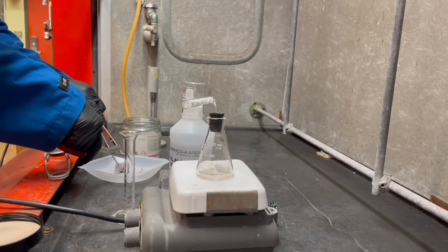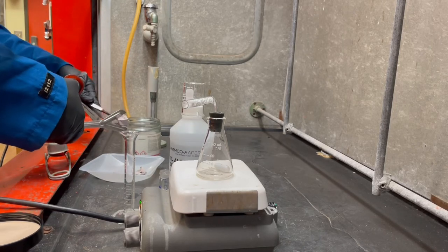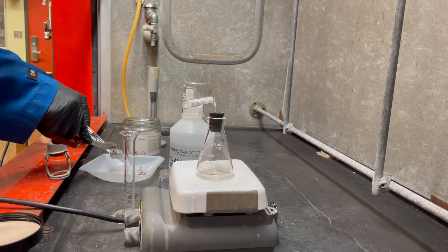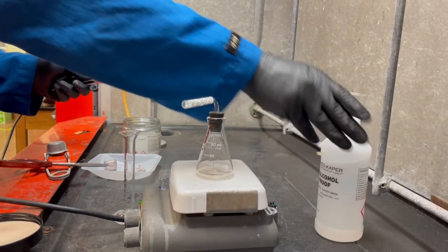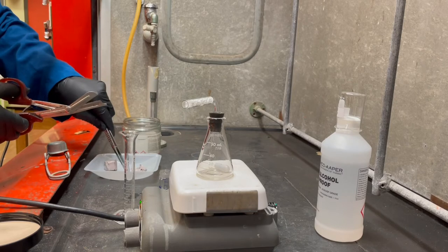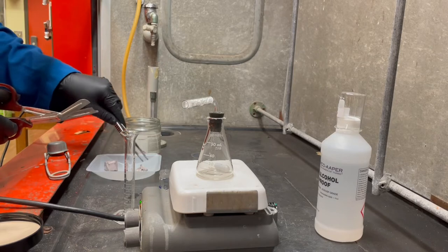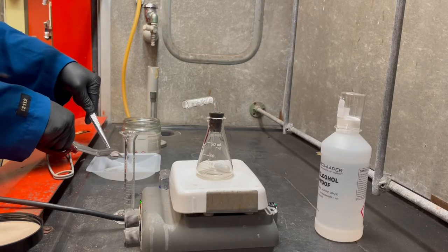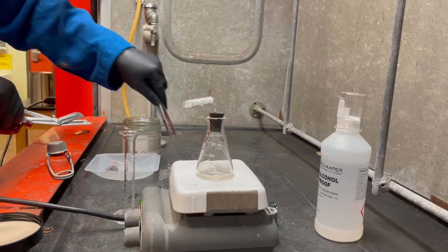And yeah, it's pretty cool, huh? You can actually use scissors to cut this guy up. And not too bad. These scissors are absolute garbage though, so you've got to be careful when you're working with it, and generally want to move quickly. And also when you're working with elemental metals and stuff that are really pyrophoric, you should be aware that some of that stuff could stick to the scissors or the forceps that you're working with as well. So right now I'm cutting the oxidized layer off, and then I'm putting those nice pieces inside of the little dish with xylenes in it.